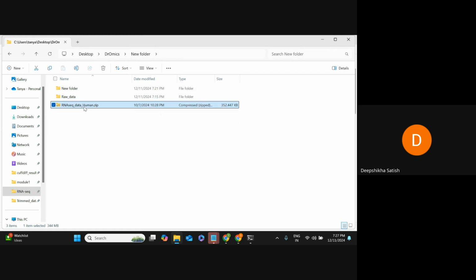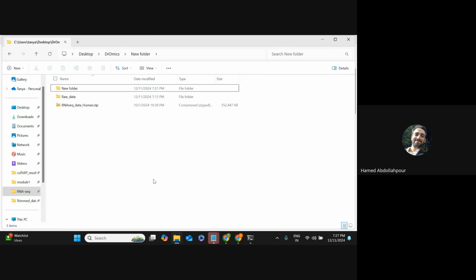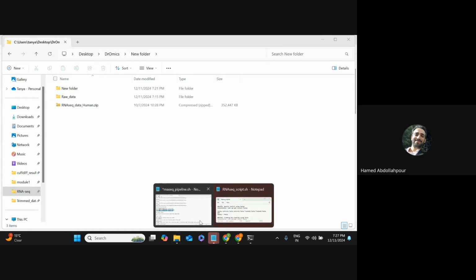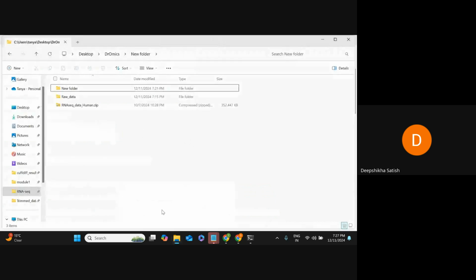Okay, Professor, you mean now we don't need to run any code? No, sir, I have already prepared it for you guys because it will take a lot of time. Exactly. Now, so everyone is having this raw data now?